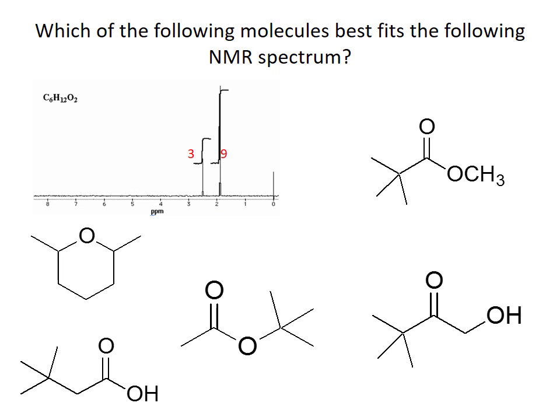Which one of these molecules fits this spectrum? Well, the integration here is given to you in numbers, so that really helps. There's 9 and there are 3, and they're both singlets. What could that possibly be? Well, whenever I see an integration of 9, I think T-butyl. Whenever I see an integration of 3, I think methyl, because that's really common for those to make that.